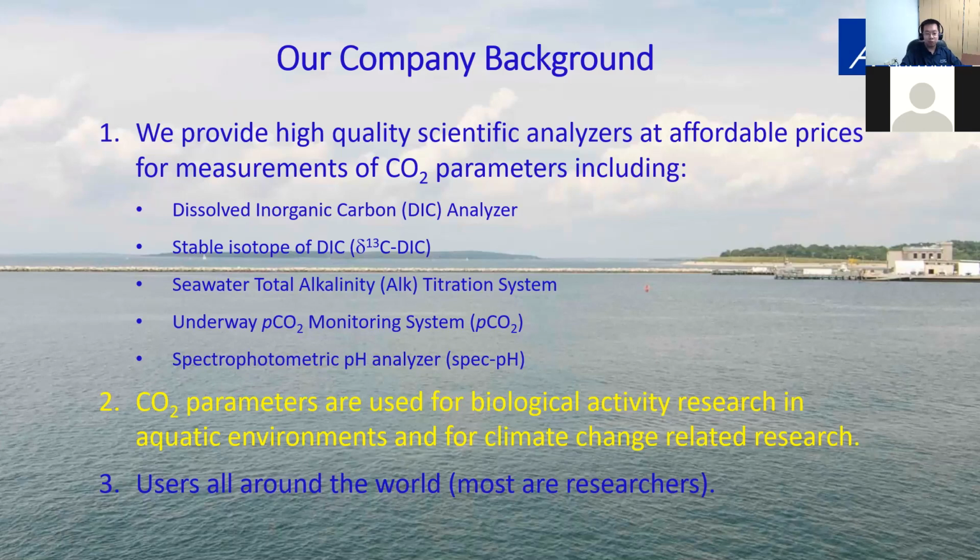These CO2 parameters are used for biological activity researches in aquatic environments and for climate change related researches. So our users are mainly researchers all around the world.